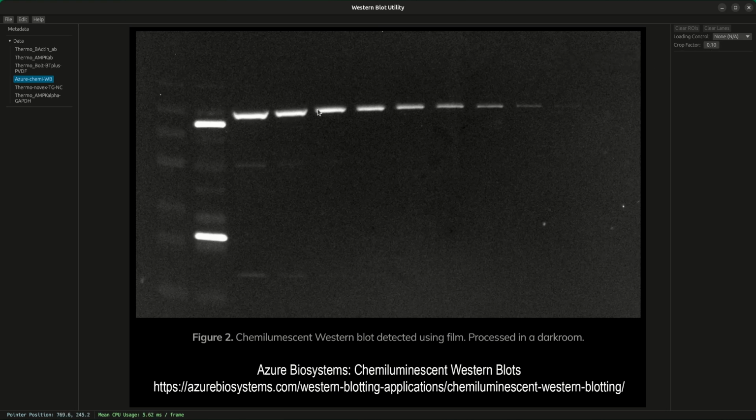So because these objects go up, we're likely going to miss a lot of the ones at the end. So if we select this, you can imagine, let's say 10% just stuck up here on top and on the bottom, and you can see how it starts to miss a lot of these ROIs.